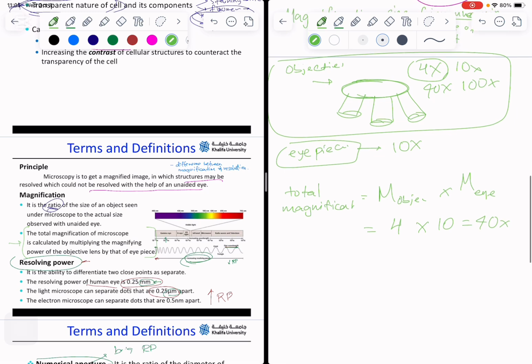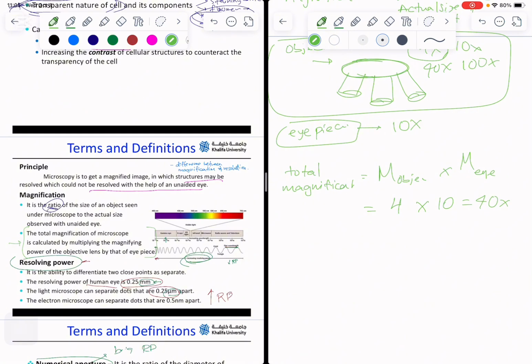Anyways, so this is the first part, that's the magnification. But magnification is not enough in order to get the soothing picture that you want in the end. For example, take your phone, open the camera app, and keep getting your phone closer and closer to the table, or to the wall. Or try zooming in closer and closer to anything. Yes, you will magnify it, but it's not going to be as soothing, as soft, as defined, or as clear. The resolution is going to be really low.